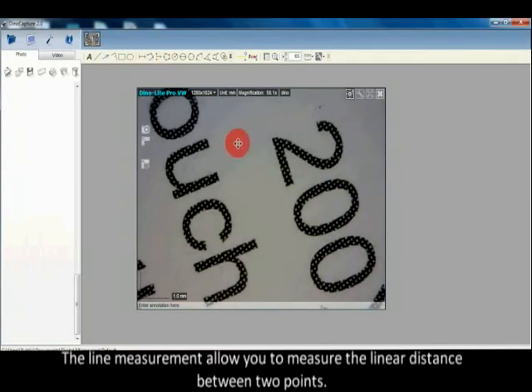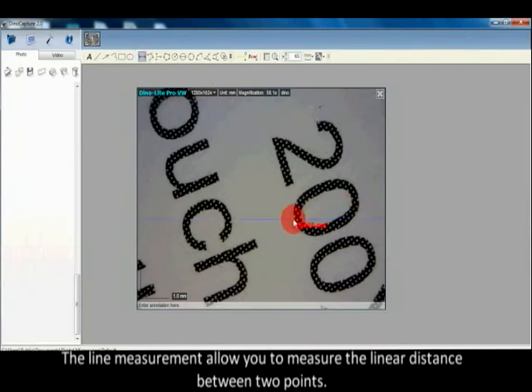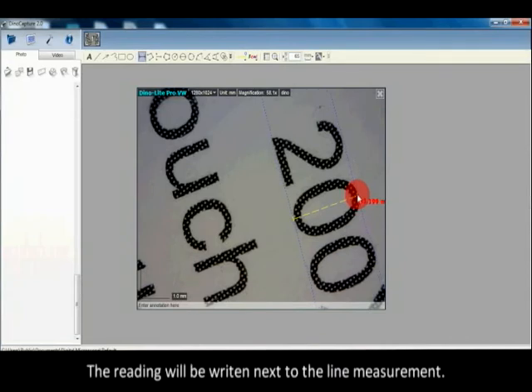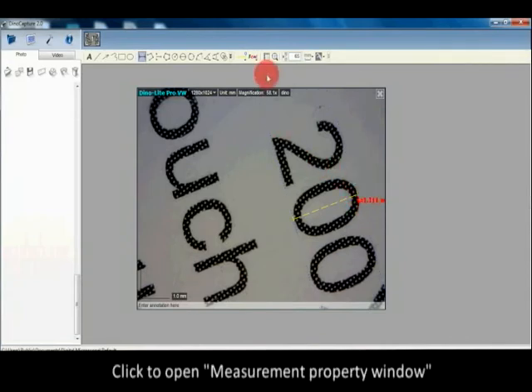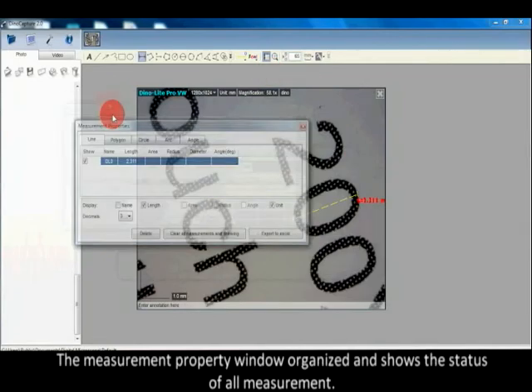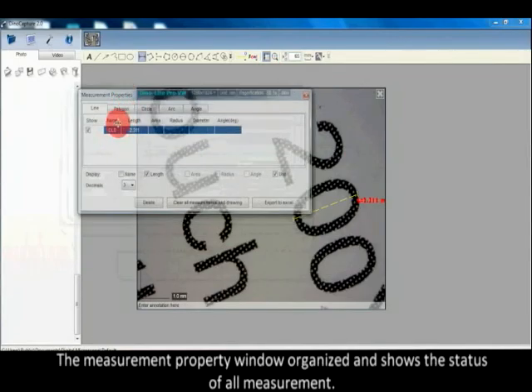The line measurement allows you to measure the linear distance between two points. The reading will be right next to the line measurement. Click to open the measurement property window.